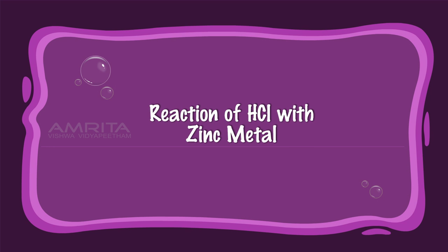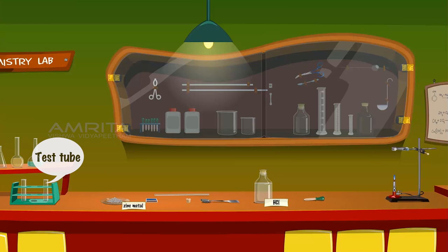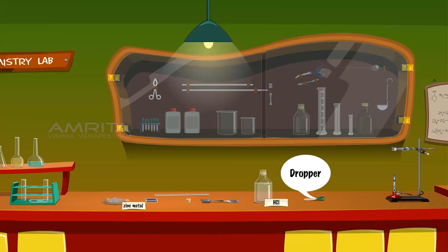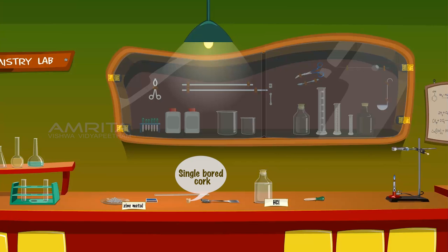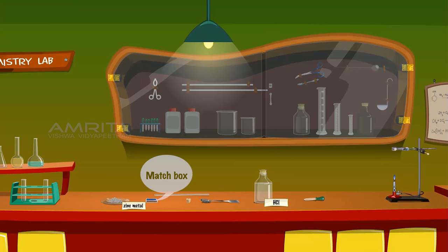Reaction of HCl with Zinc Metal. We require a test tube, a small piece of zinc metal in a dish, a spatula, HCl solution, a dropper, a stand with a clamp, a single board cork, a jet tube, Bunsen burner, and a matchbox.